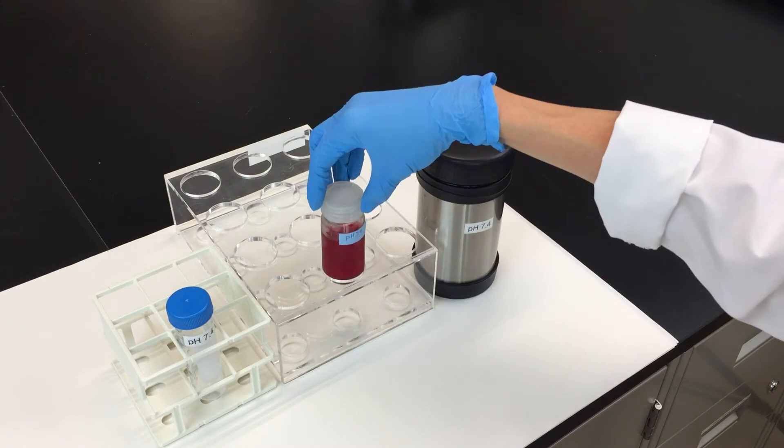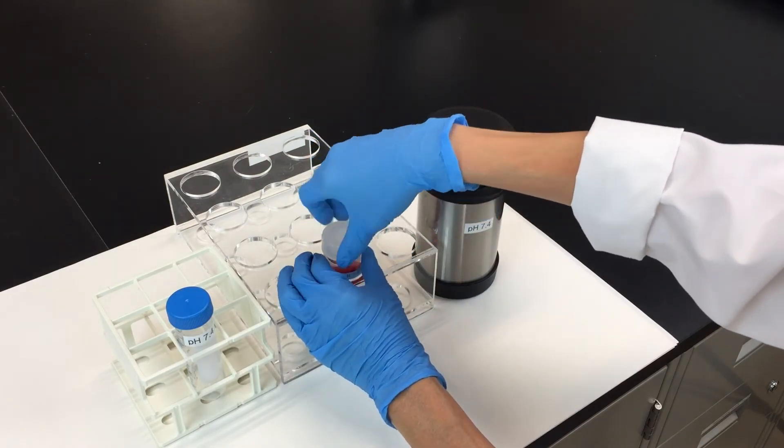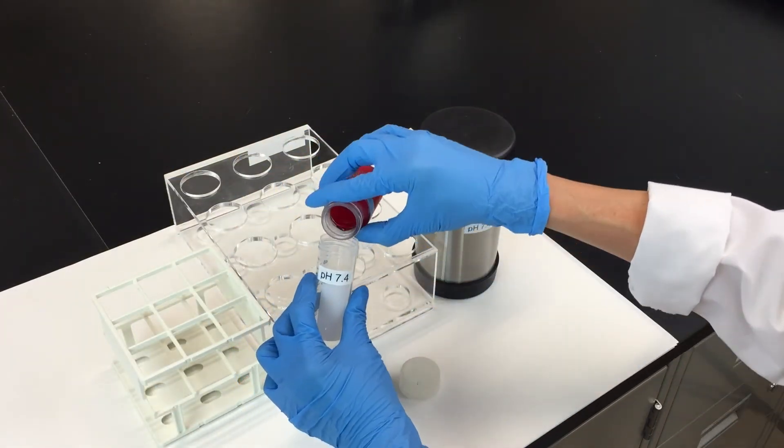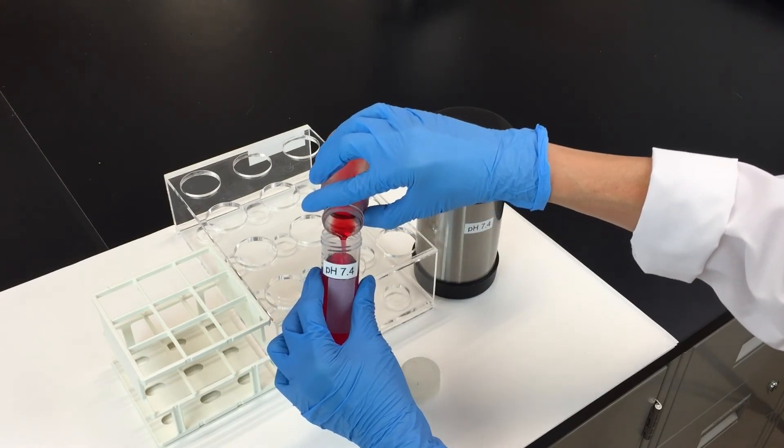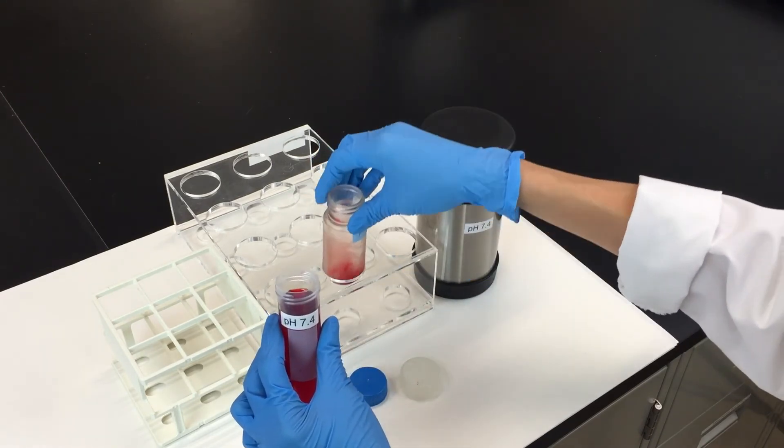After the spin, pour the liquid into a tube labeled pH 7.4 and discard the pellet. Put the tube on ice and your hemolysate is now ready to use.